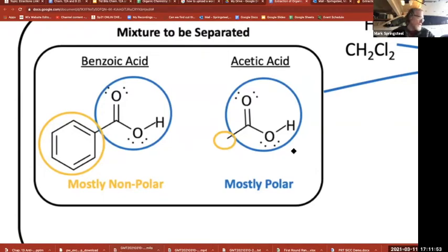So when I put the methylene chloride and the water in the centrifuge tube together, they'll form 2 layers. What will be the top layer and what will be the bottom layer? Top would be the water. Mm-hmm. Yeah, the methylene chloride is the more dense organic solvent, huh?